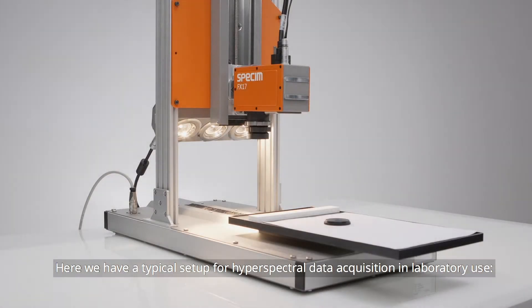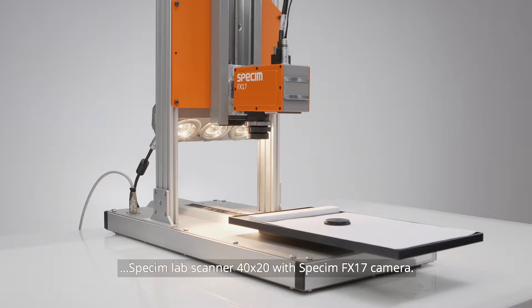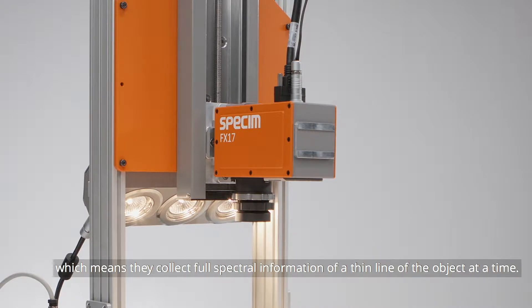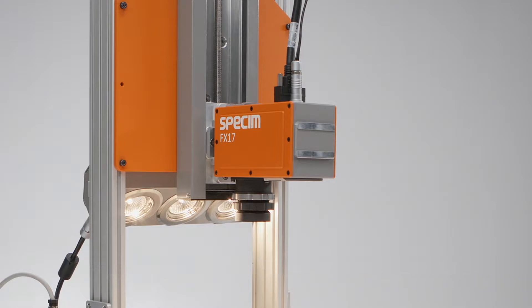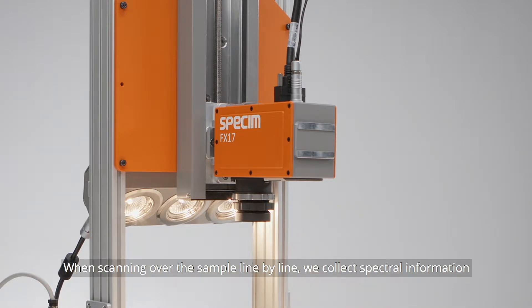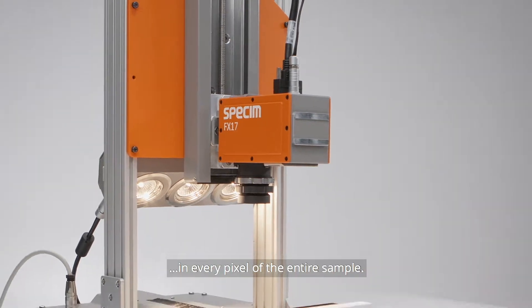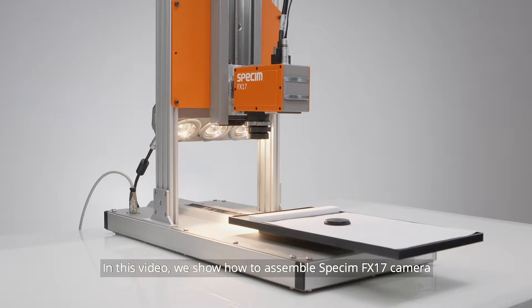Here we have a typical set-up for hyperspectral data acquisition in laboratory use: the Spec-Im Lab Scanner 40x20 with Spec-Im FX17 camera. Spec-Im sensors are line-scanning sensors, which means they collect the full spectral information of a thin line of the object at a time. When scanning over the sample line by line, we collect spectral information in every pixel of the entire sample. In this video, we show you how to assemble the Spec-Im FX17 camera to the Spec-Im Lab Scanner 40x20.